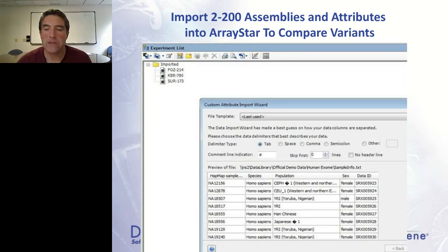Back when we were developing our human genome assembler, we quickly realized there was a need to be able to assess the assembly and look at the SNPs that were found in one version of the assembler, then make some improvements and see, did it get better? Is it the same? And again, look at those variations, look at curated HapMap data sets, exome and genome level, to make sure that we're finding all the SNPs. So you want to develop something that's highly accurate as well.